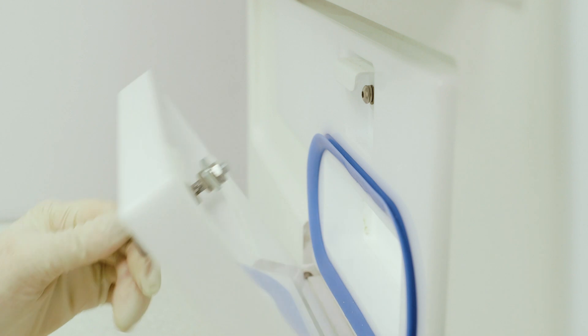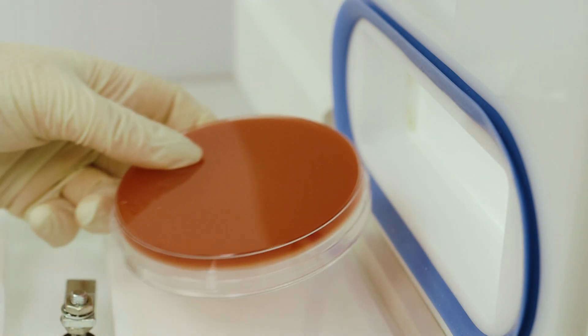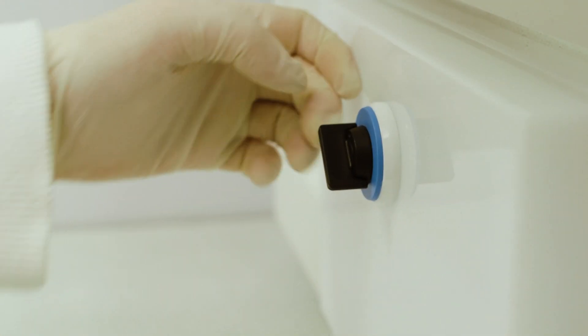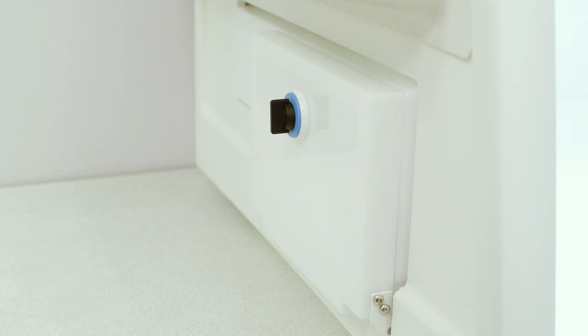Letterbox entry systems are also available, providing a straightforward way to quickly introduce individual items such as an individual petri dish into the workstation.